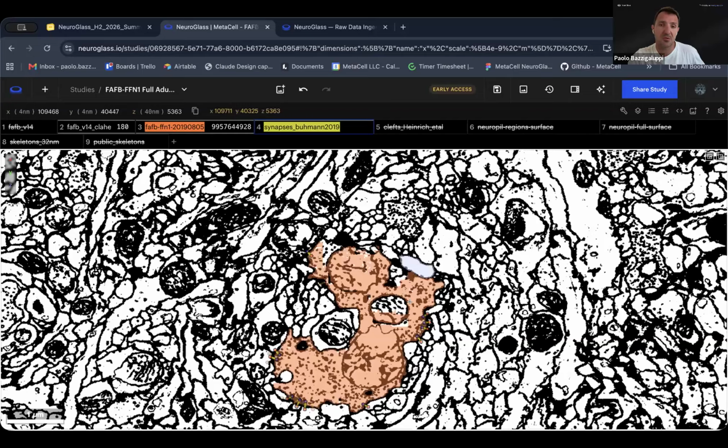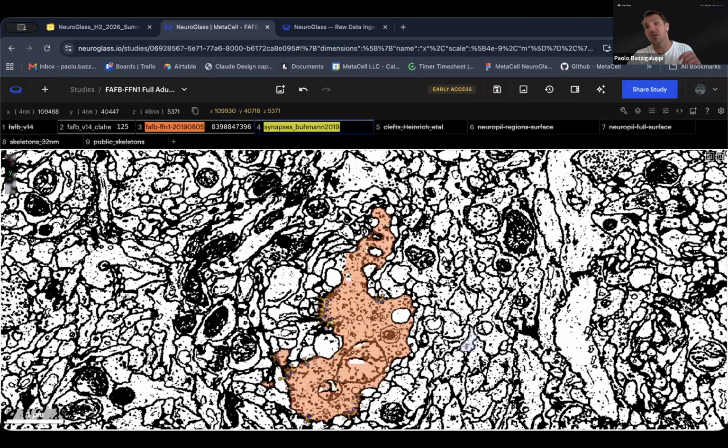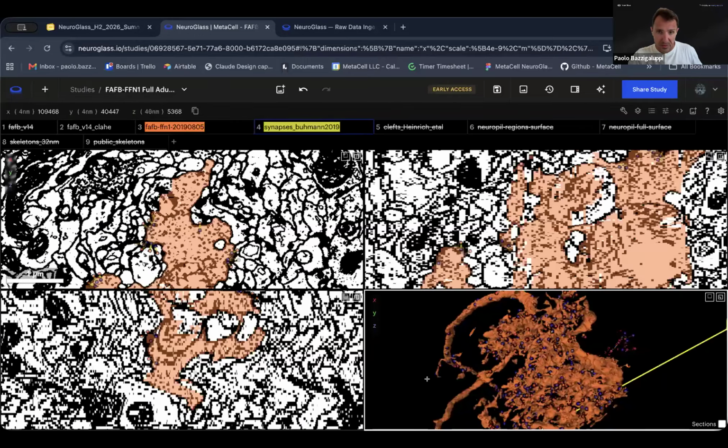We're going to focus first on CellPose-SAM. That is the first AI pipeline that we want to integrate and make accessible to the user inside NeuroGlass. But we are also keeping our eyes on what is more interesting for the community. Since we really want to connect with you and with users, please reach out and let us know, either in the comments of this chat or via email, which AI processing pipelines you think are most useful for your data.